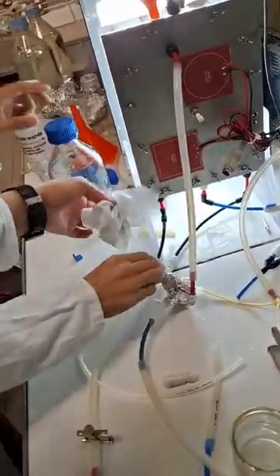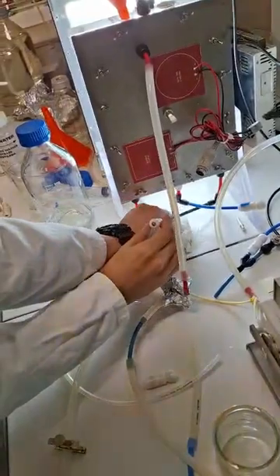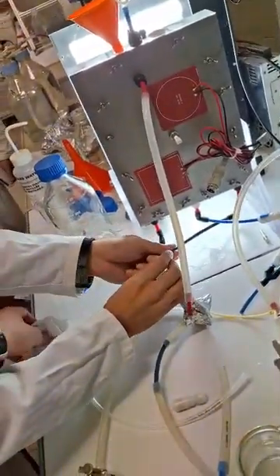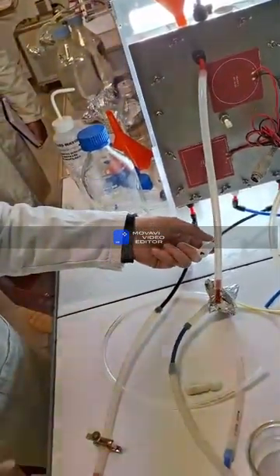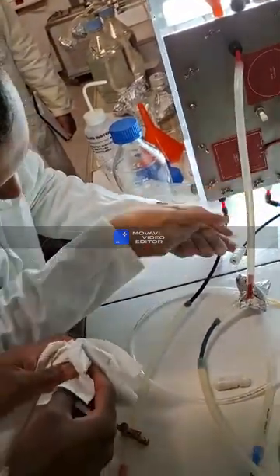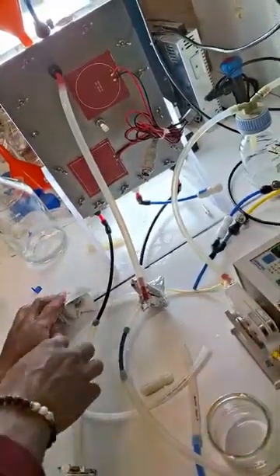Do we still need more? There is still a problem. Maybe this is not well fixed.